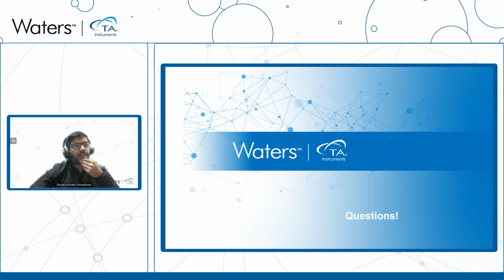Yeah, the answer is yes, but you have to account for the change in stiffness that the sample is experiencing during the applied stress or strain as you go through the transition. The good news is that in all of our DMAs, we have a built-in feature referred to as force track, which intelligently monitors your change in stiffness with time and modifies the mean stress or strain level being applied to the sample.